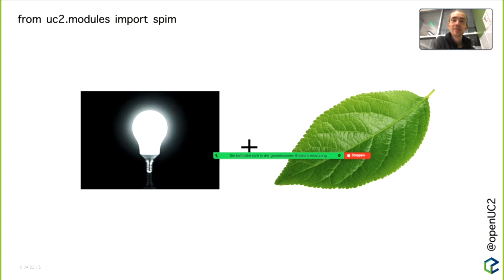So right now I'm in Manu Prakash's lab. Maybe some of you are familiar with him. He's one of the people behind the Foldscope project and many others. So our interest lies in visualizing the diversity of plankton from the sea. And one way of doing that is using volumetric imaging methods. For example, light sheet. I think you may know light sheets.